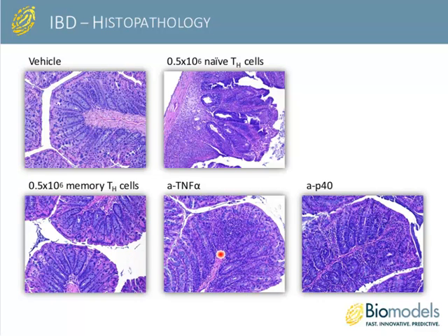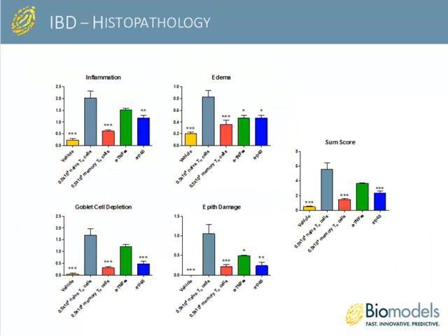They look very, very healthy, almost as good as the completely disease-free control. So while the weight loss isn't showing very much difference, certainly the histology is enabling you to see a significant effect of those positive control antibodies.